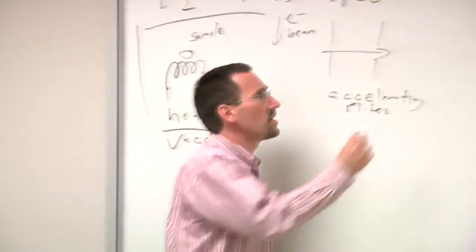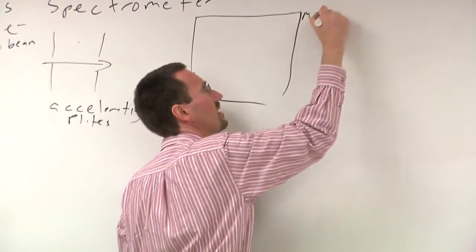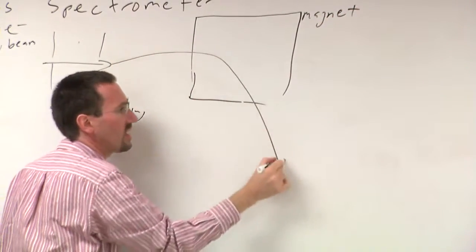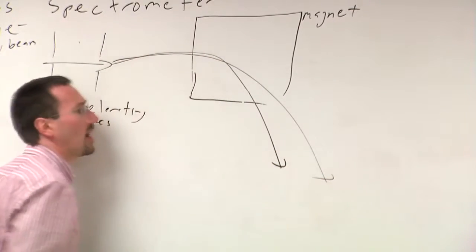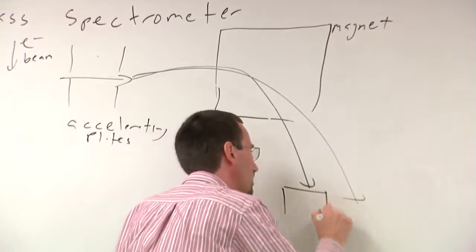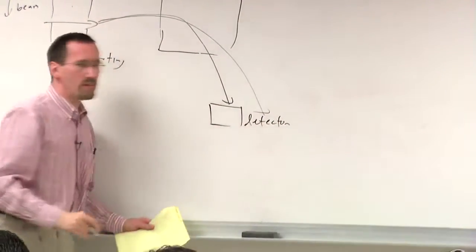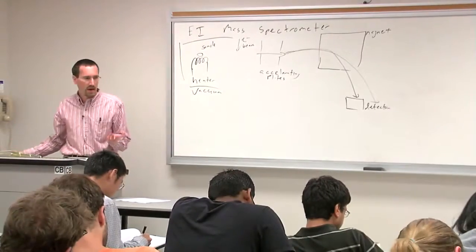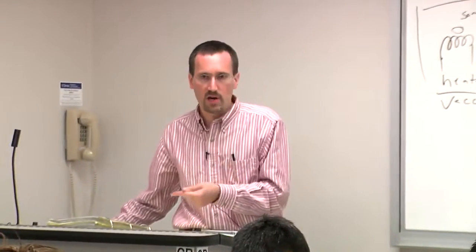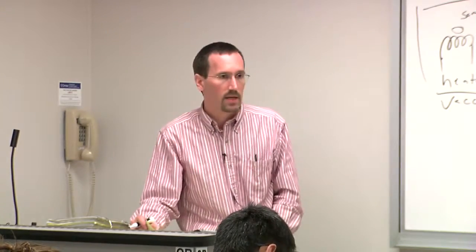And then, as I said, we will, in what's called a magnetic sector instrument, the oldest sort of instrument, have a magnet, an electromagnet. The molecules will move in, and dependent on their mass to charge ratio, will go to a detector. And the detector basically measures electrical signal. The molecules are charged, and so you get a current, and you can amplify that current and therefore send that current on to a recording device or a computer.